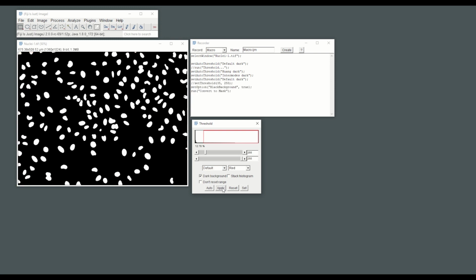into the binary mask. If you look at the recorder, after the select window command, we have some recordings that we don't need in our scripts, as these were from my testing of different methods before selecting the default method. So I'm going to delete this part. As you can see, curating the recordings as you go and keeping them neat and tidy is very important, as otherwise, at the end, there are so many commands recorded, and it will be very hard to figure out which is the correct one I would like to use.